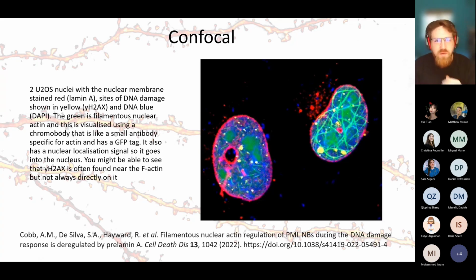The benefit, again, as I said, with confocal imaging, is that you get these bright, high contrast image data. And also in some cases like this, you get very visually stunning images. I had mentioned we used to run an image competition, and this was one of the winning entries. So I always like to use those images where I can.